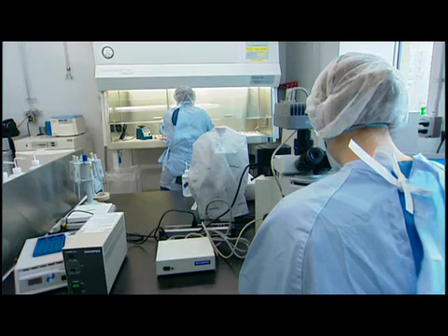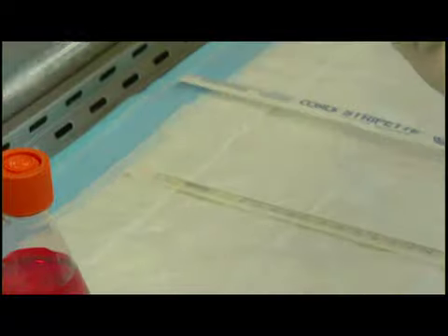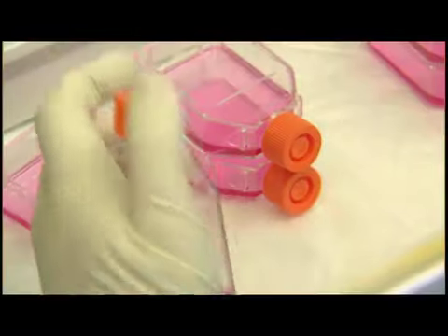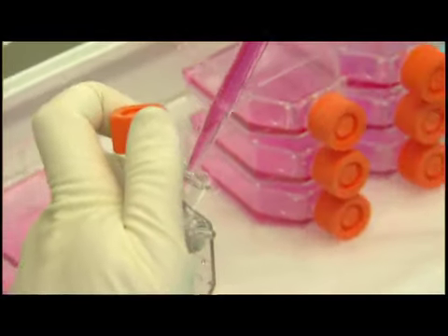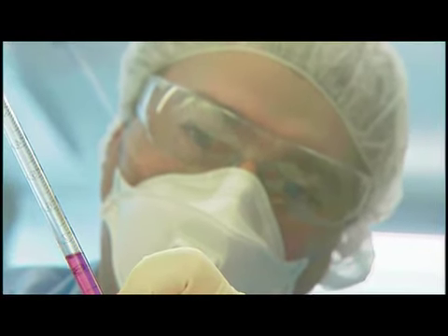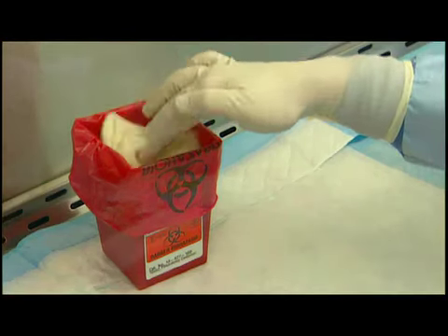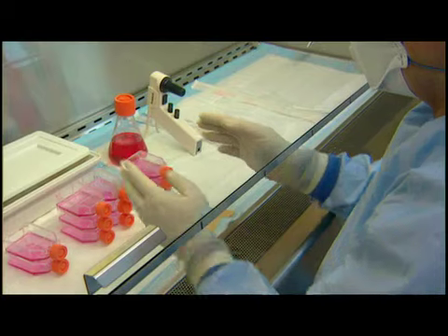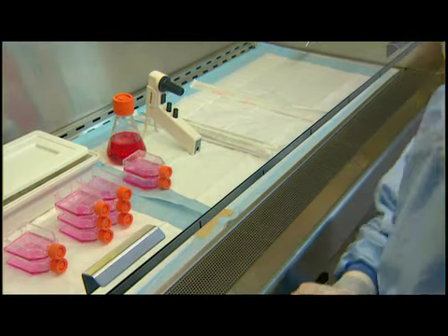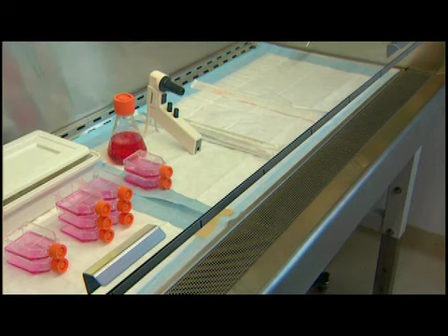For maximum protection against aerosols, you should work toward the rear of the cabinet so the air flows away from you towards the rear. In order not to disturb the general airflow, avoid excessive movement inside the cabinet. And if you do need to reach out of the cabinet, remember to remove your outer gloves first and then move out your arms slowly and perpendicular to the front opening. Always allow the air in the cabinet to stabilize before resuming your work. Keep all discarded material inside the cabinet.